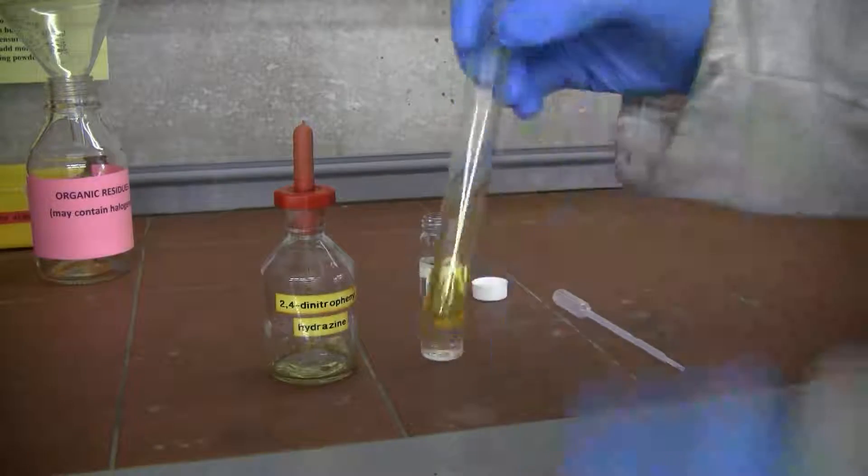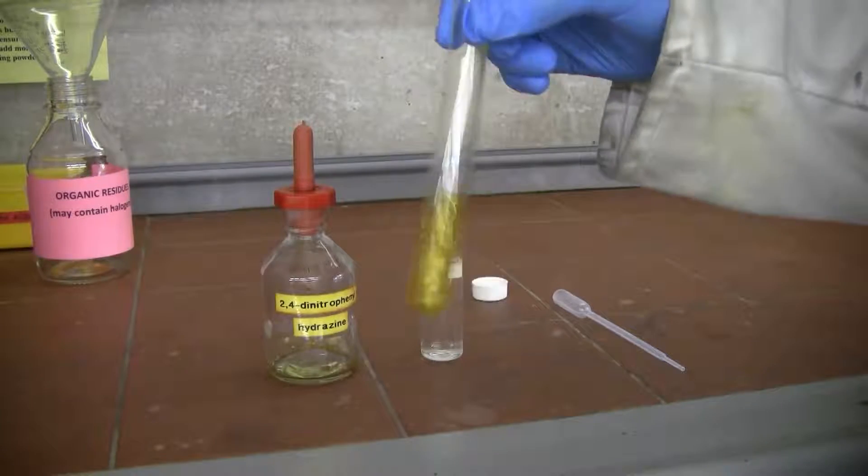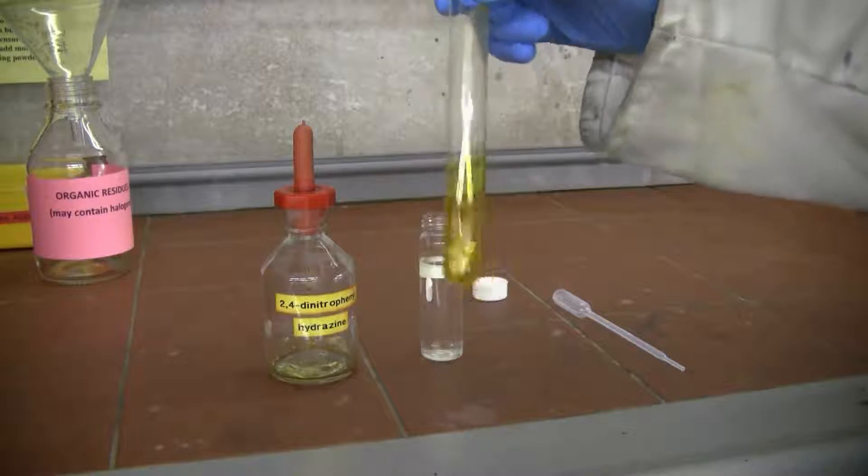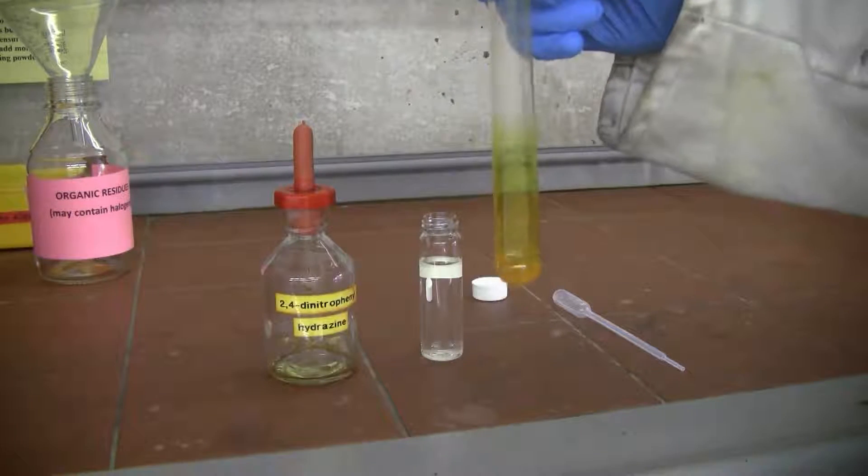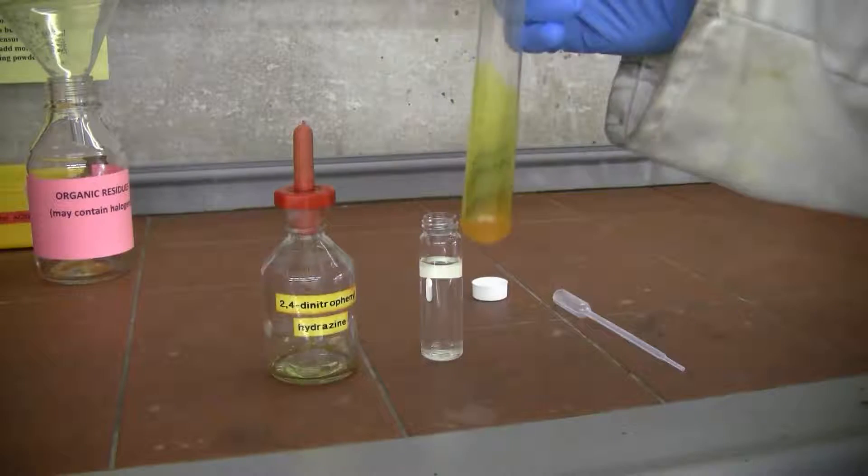Welcome to your organic chemistry practice. You'll be doing a variety of different reactions, none of them too difficult—a lot of test tube reactions to learn more about the chemicals you're working with. But before we go any further, we've got to stop and talk safety.